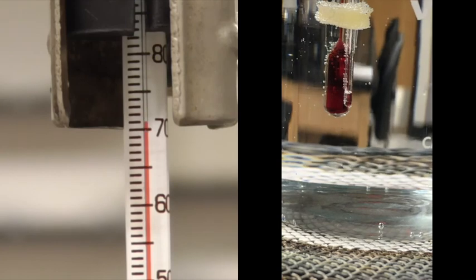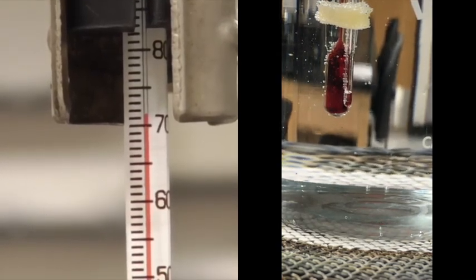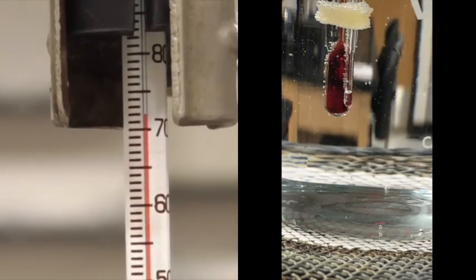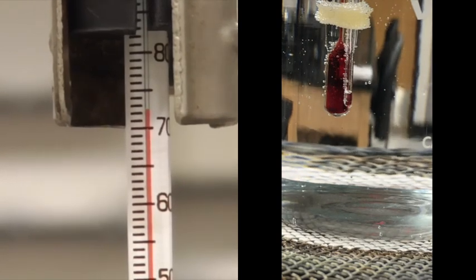Hopefully you didn't miss that. If you did, you've got to go back and do it again. Rewind, which is good because if you're in lab, you just have to do it again. So I'm going to take that one off and put a second sample on there, and we're going to do it again and try to get a better range.